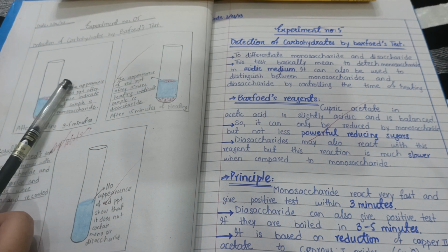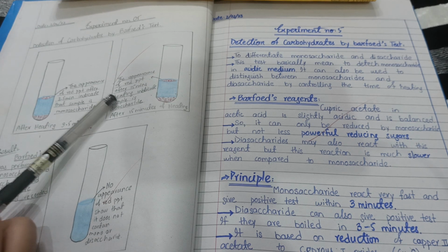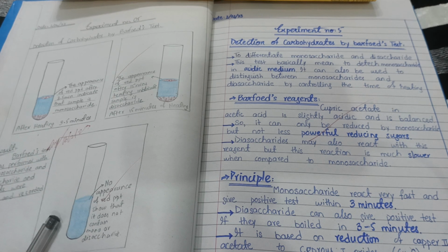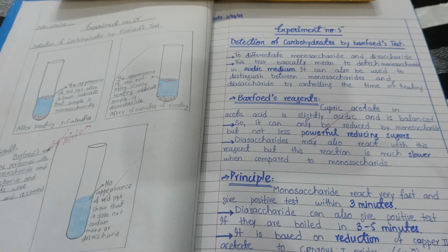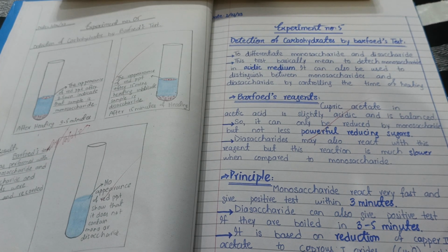But if it appears after 15 minutes or after 10 minutes, it indicates that it is a disaccharide. And if there is no appearance of a red ppt, it shows that there is no monosaccharide as well as no disaccharide in it. So this was the main summary of the Barfoed test.